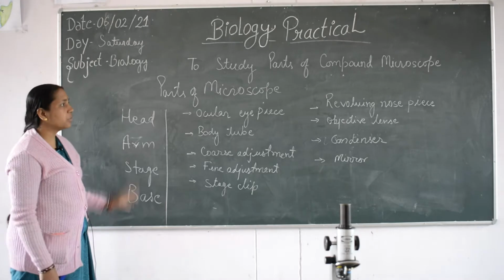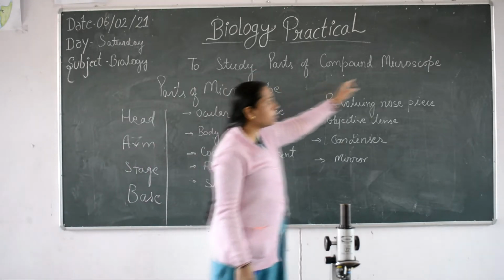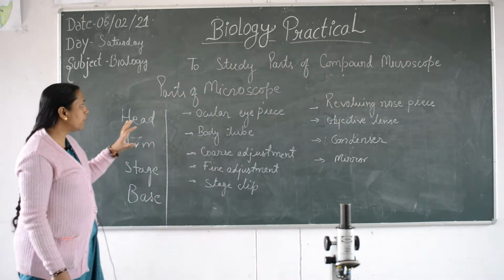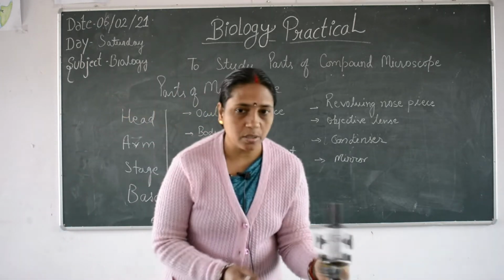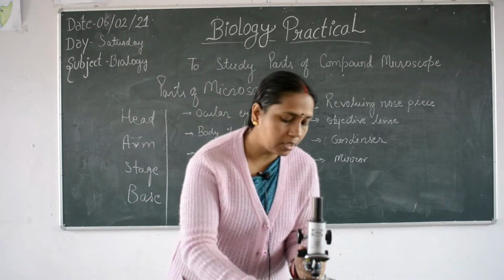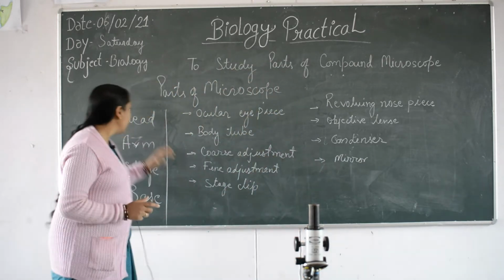Today we are going to do our next practical, which is to study parts of the compound microscope. Now you can see this is the compound microscope. I am going to tell you about all its parts.